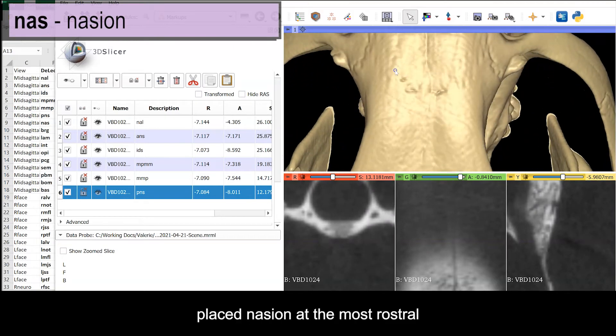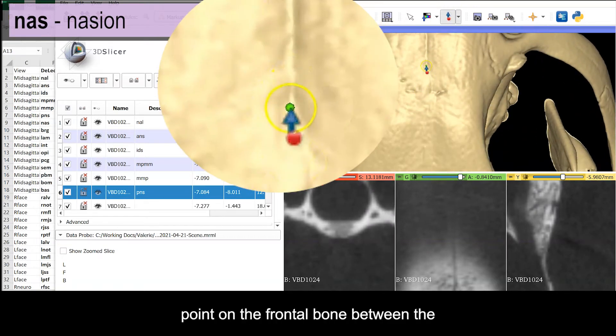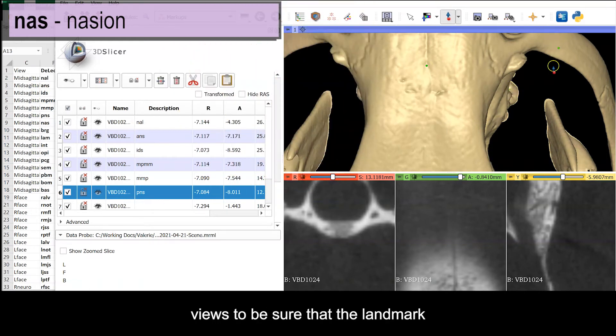Moving to the dorsal surface, place nasion at the most rostral point on the frontal bone between the nasal bones and checking orthogonal views to be sure that the landmark is not falling into the suture.